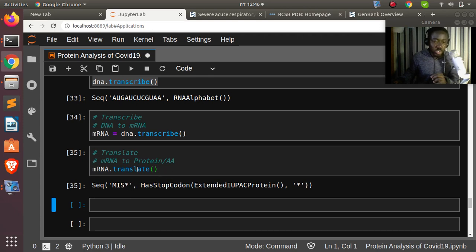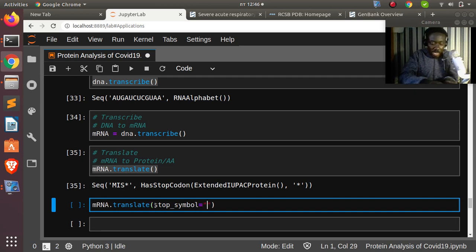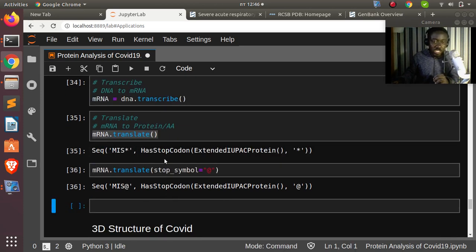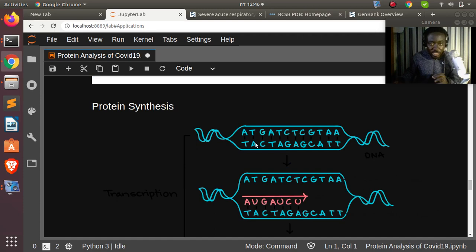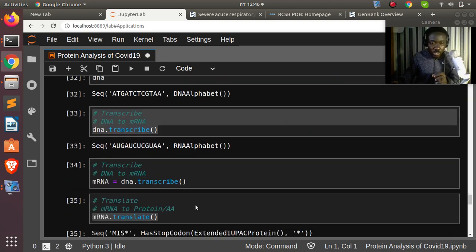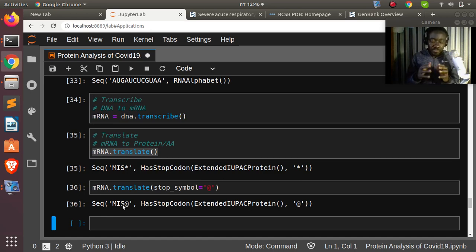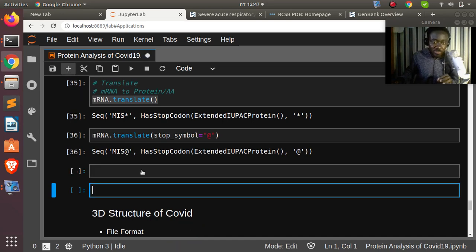You can customize the stop codon symbol by passing stop_symbol='@' (or any character) to translate(). That gives us 'MIS' — methionine, isoleucine, serine — the amino acids from our sequence. So we have converted a simple DNA through transcription and translation into amino acids.